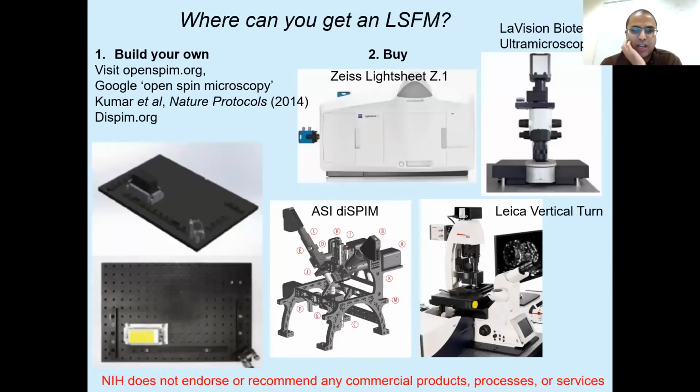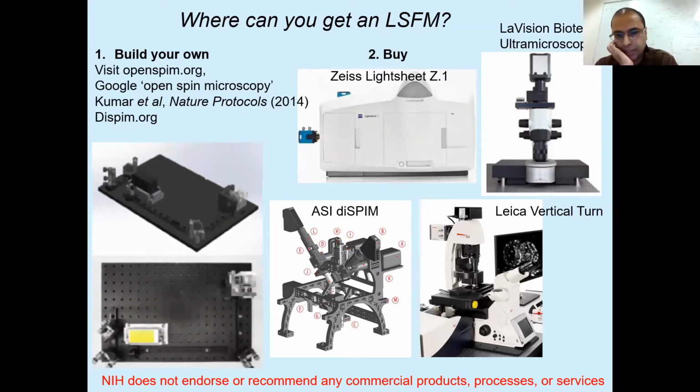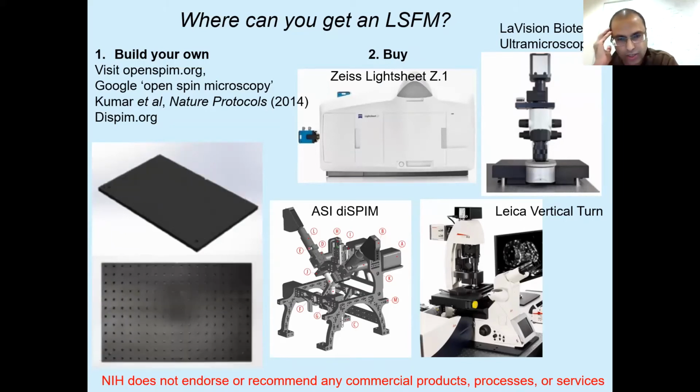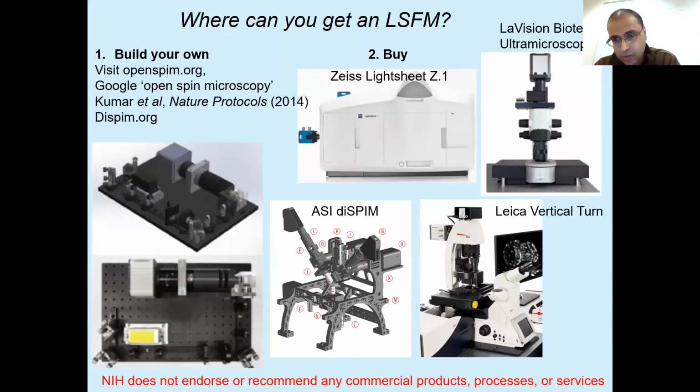So finally, I just scratched the surface, right? I just told you about a few different light sheet microscopes. I think there are many options. You can build your own, you can buy them from all of the main microscopy companies now, or you can buy them from smaller outfitters like ASI or LaVision. Each of these microscopes has strengths and weaknesses. So anybody who claims that their microscope is the be-all or end-all is just selling you snake oil. So approach this with a skeptical eye.